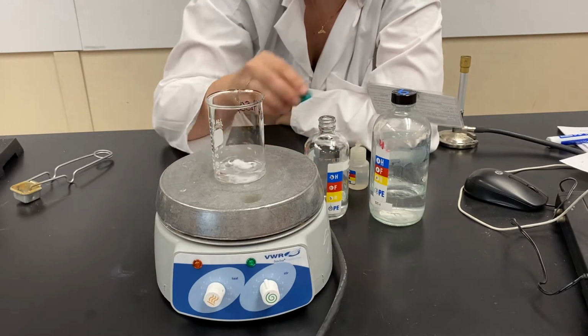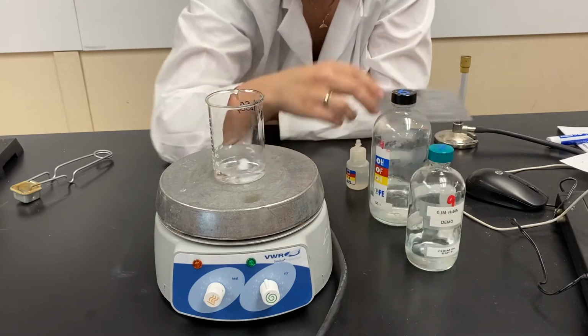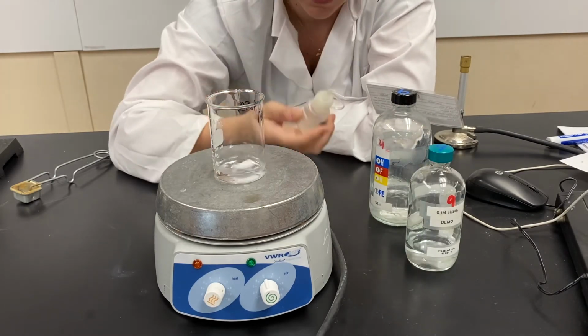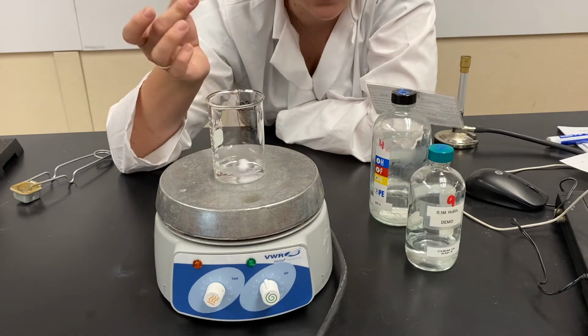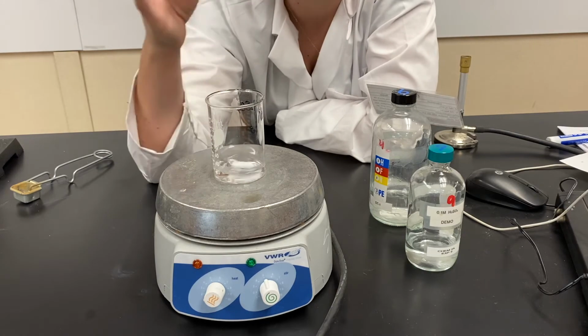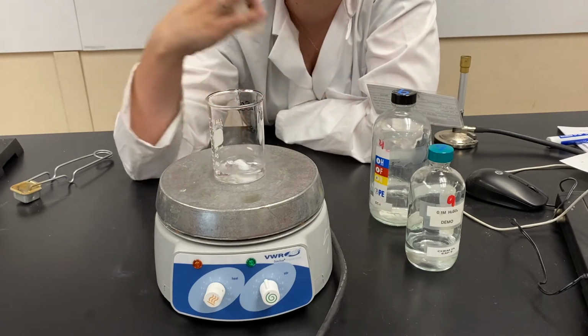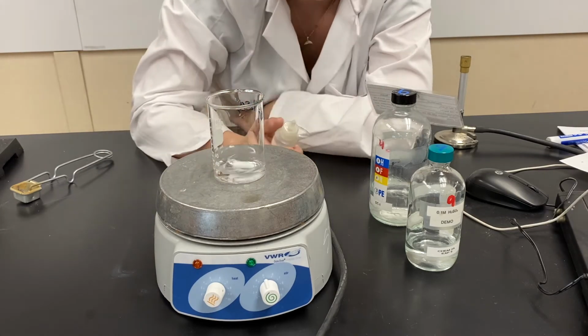All right, and what we're going to do is add some phenolphthalein, or PTH, okay? It's an indicator, which just means it's a color changer. It will indicate what pH the solution is. So phenolphthalein turns pink if a solution turns basic. Okay, so if the solution is acidic, I shouldn't see any color in it.